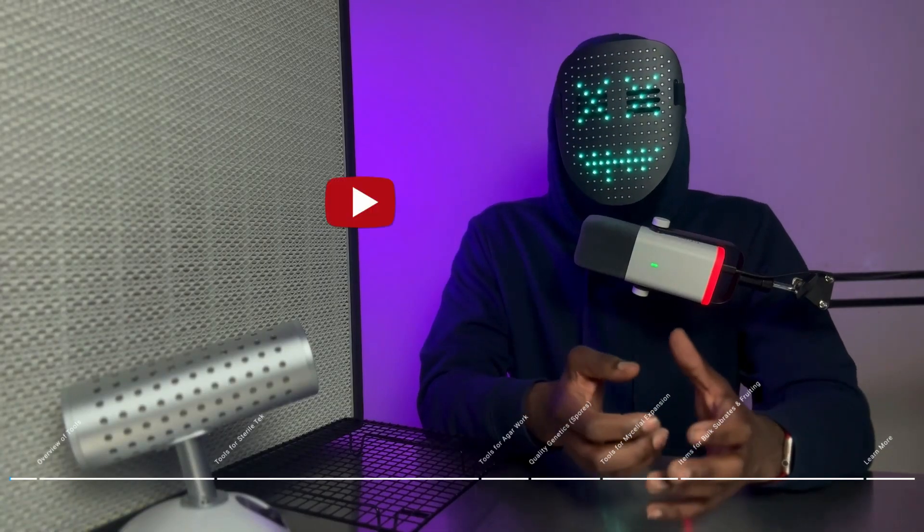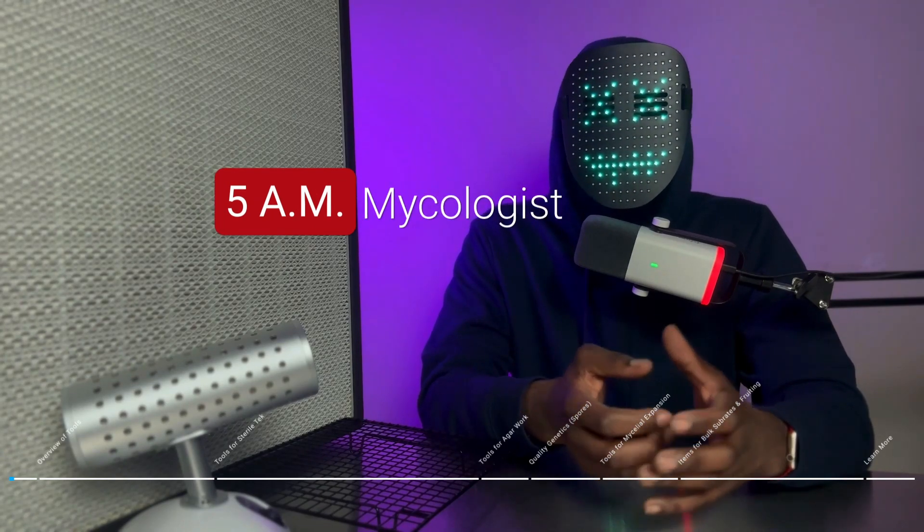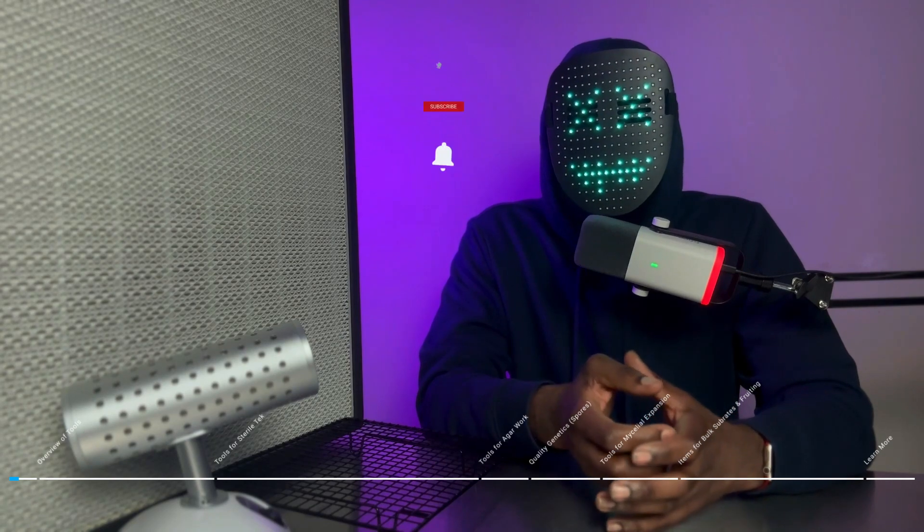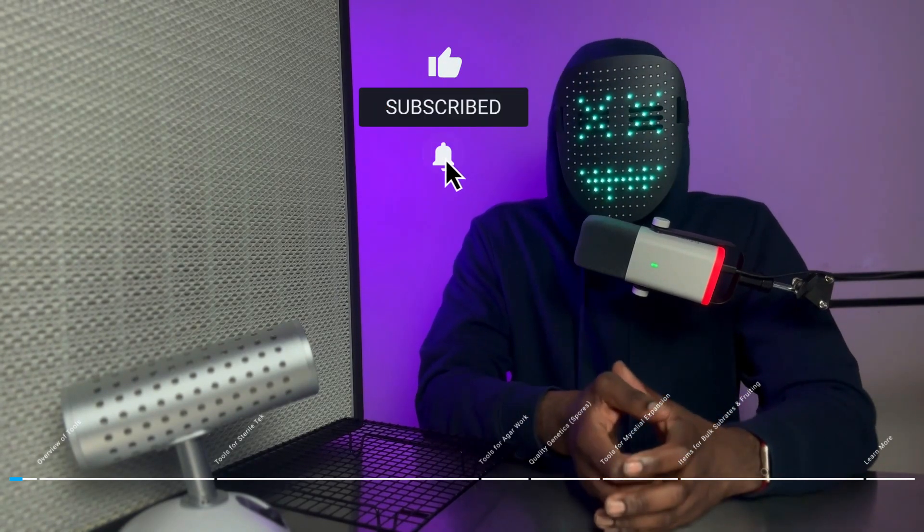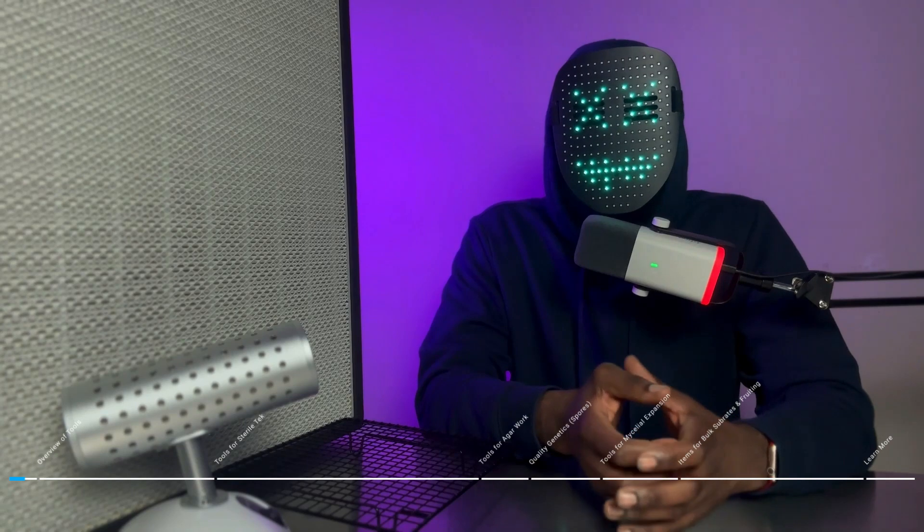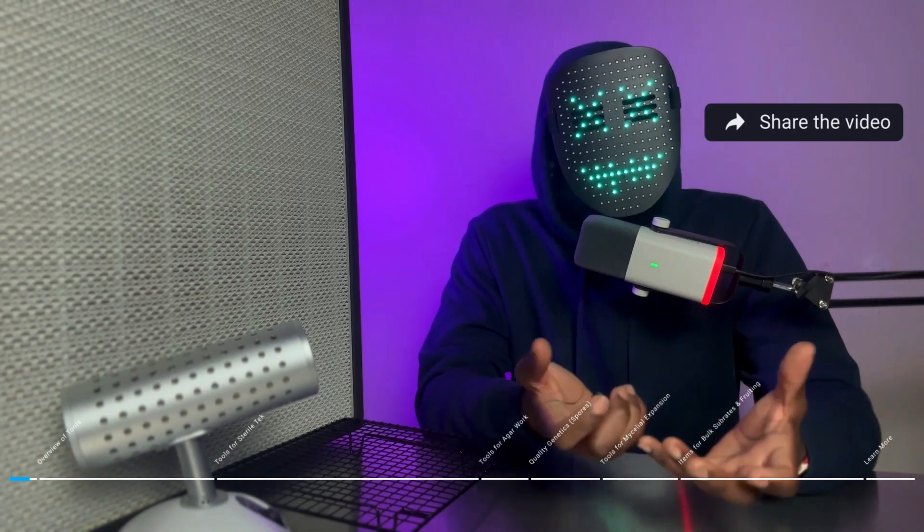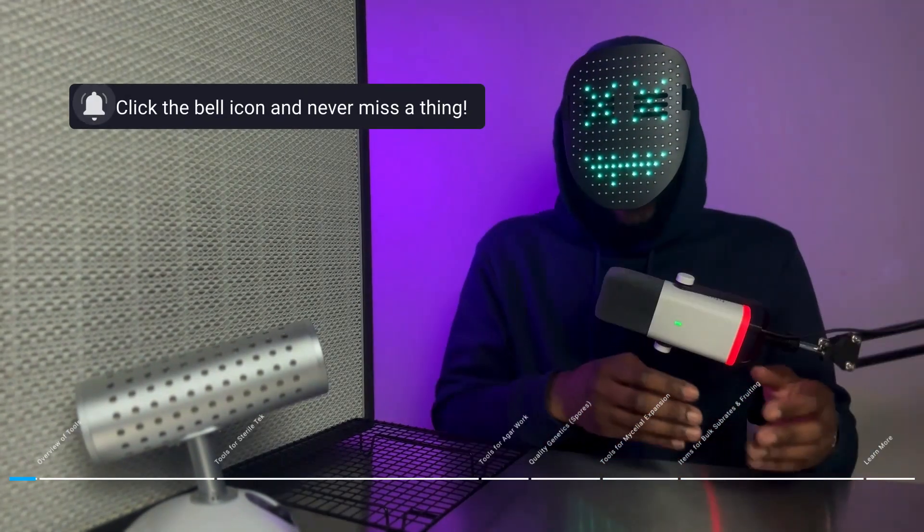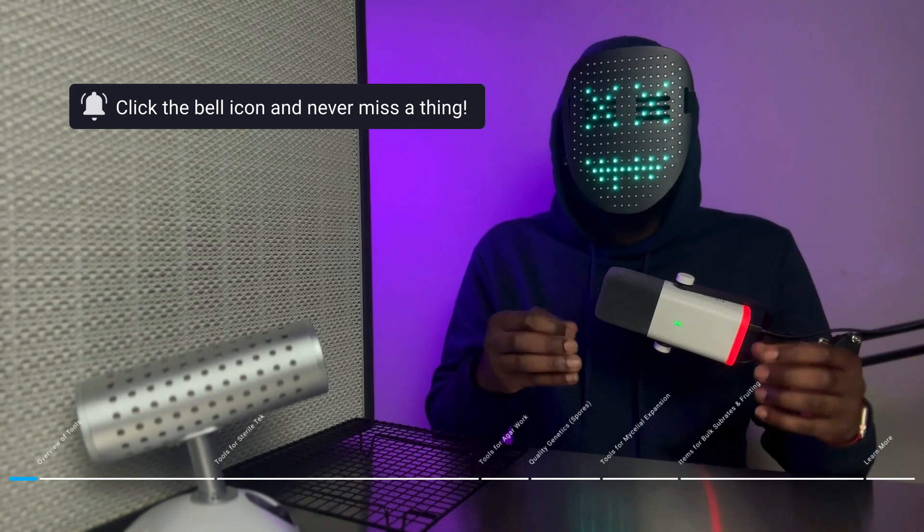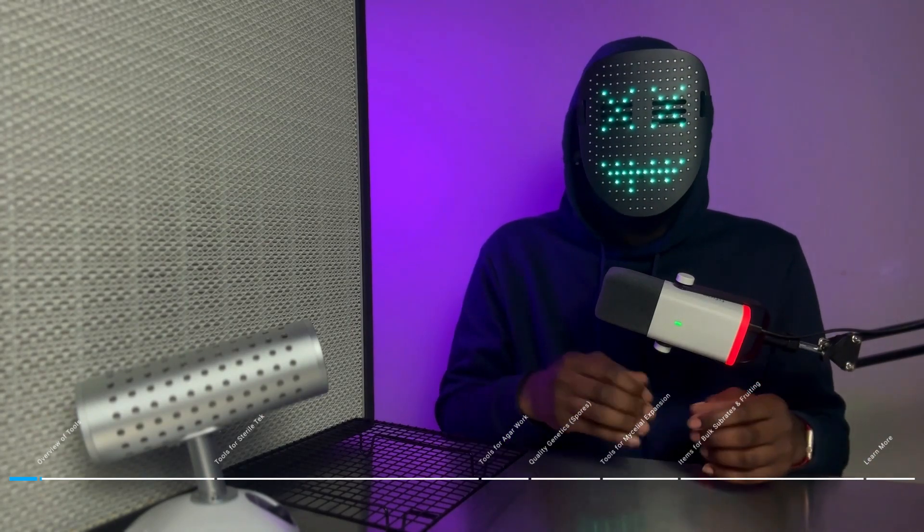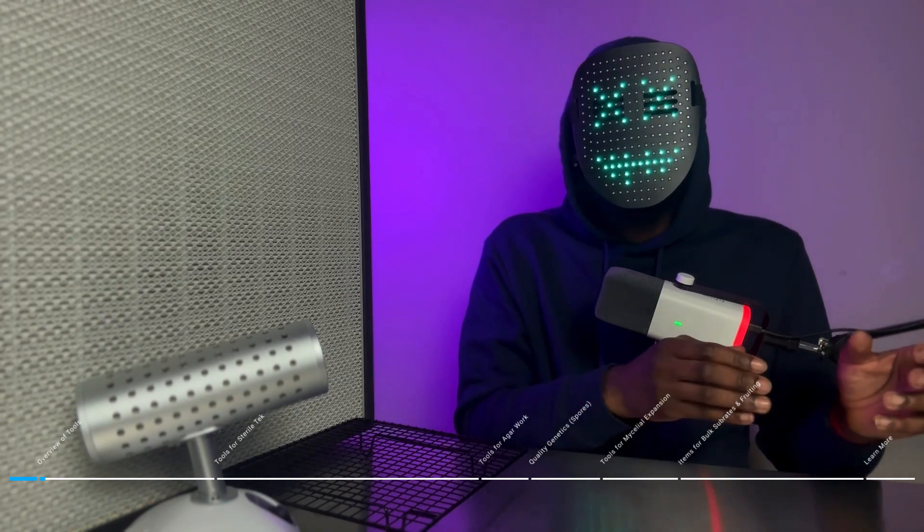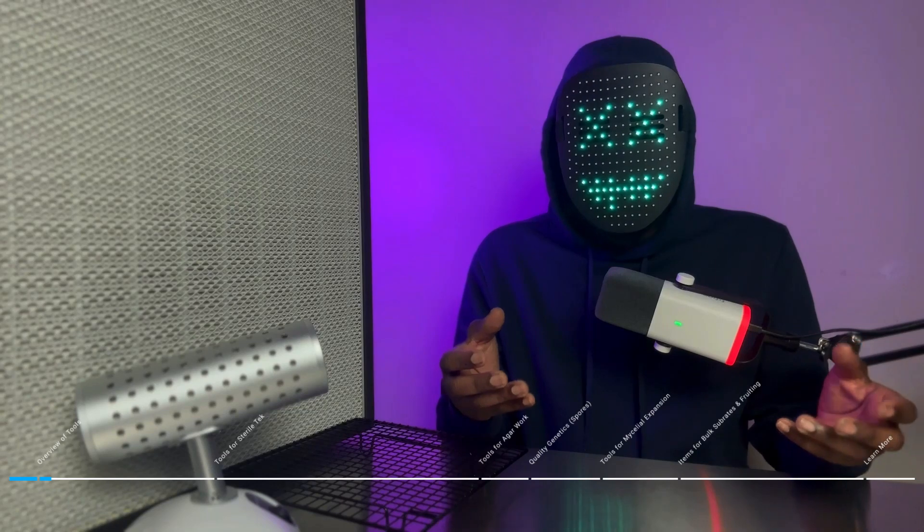I'm about to provide you guys with a complete list of all the tools that you'll need to start the process of growing mushrooms in the next 96 hours. The majority of the items that I list off in this video are available on Amazon with one to two day shipping options. I've divided the list of tools that you'll need into categories with respect to their priority level and the role that they play in the overall process of growing mushrooms.